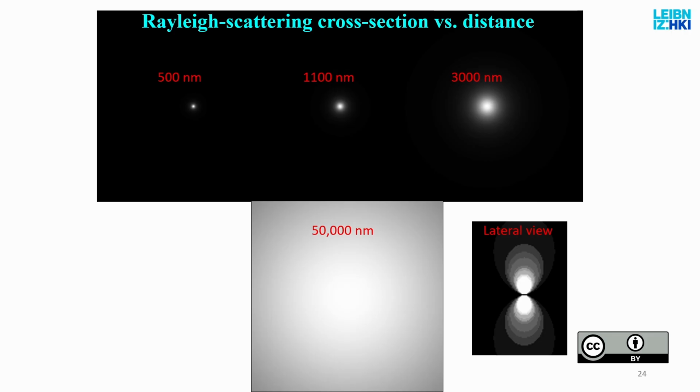This I assume to have Rayleigh scattering to be seen. This is because this is easy to put into a computer. There's a closed formula for this. But if you look from 50 micrometers of tissue, you lost all the information. So light scattering can really kill your microscope experiments in this regard.